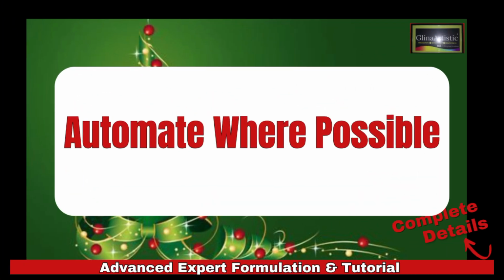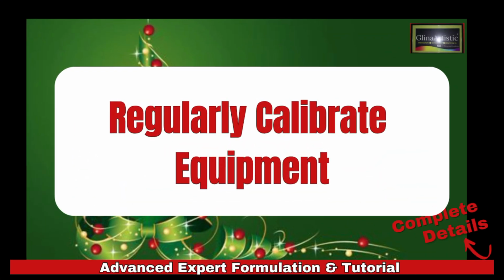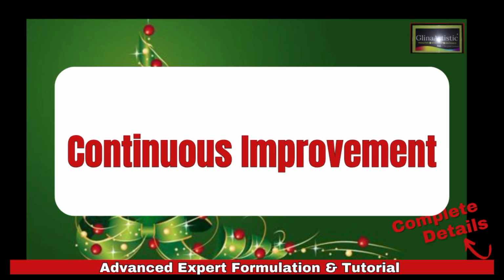And then we have automate where possible. Yes, this simply means you use automated mixers and testing equipment to minimize errors. As you grow, you can get that. And then you have your regular calibration of equipment, which I simply tell you, you have to ensure your tools are accurate. Please, they're accurate and you clean them. And continuous improvement. You use your test results to refine your formula and process. Very, very, very important.